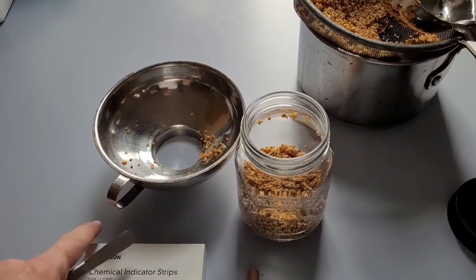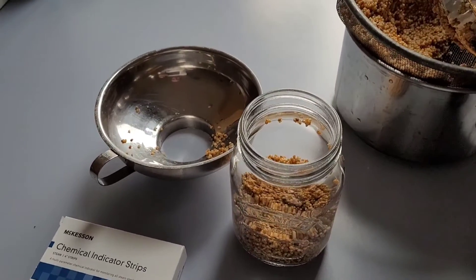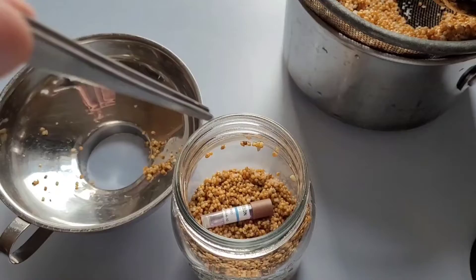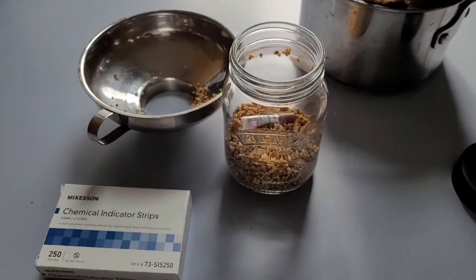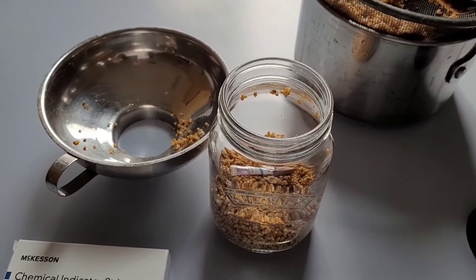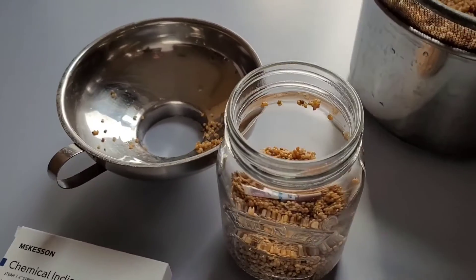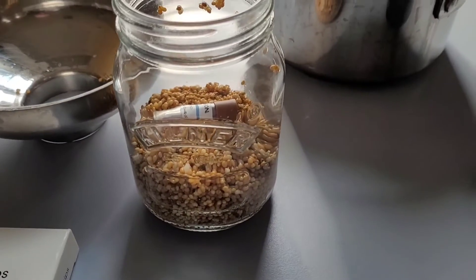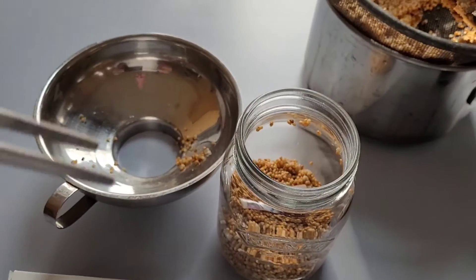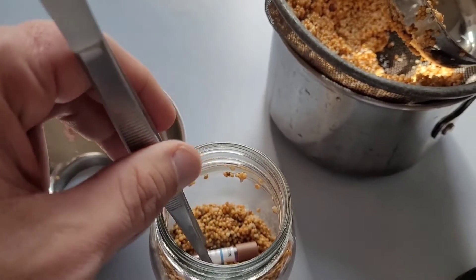This time I'm going to be running pint jars as opposed to the one-liter grain jars. I'm using the pint jars because they're more representative of reality. Nobody's running liters or quart jars on their sides in there. As far as I'm aware, people are doing four pint jars. So this is more representative of the actual load that will be cycled in there.